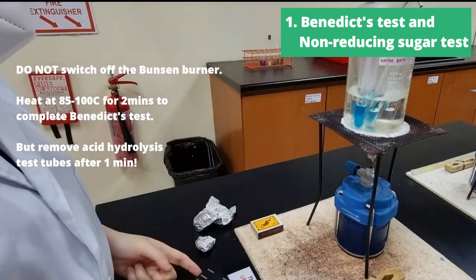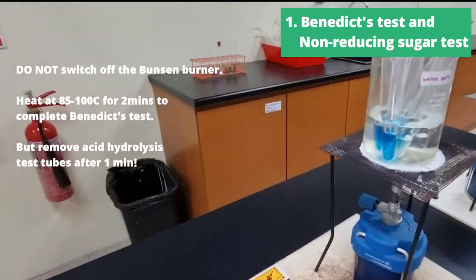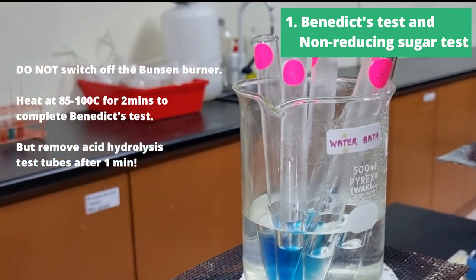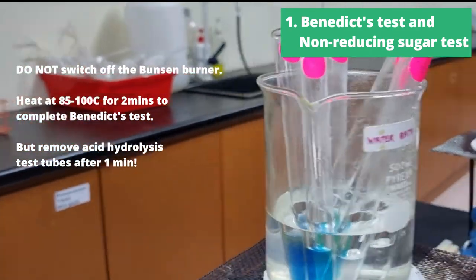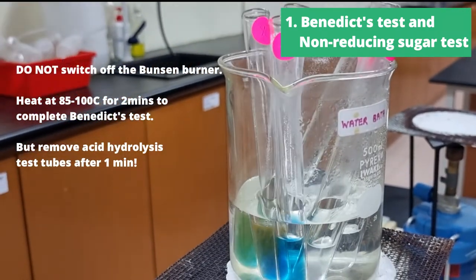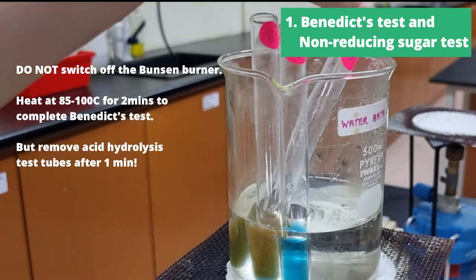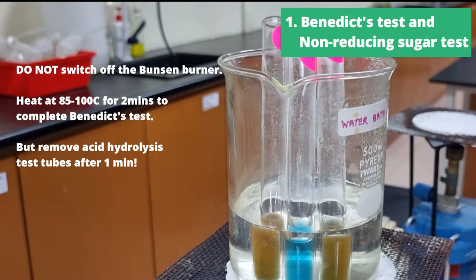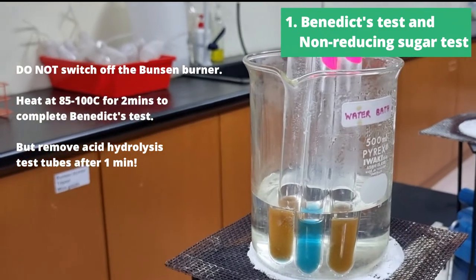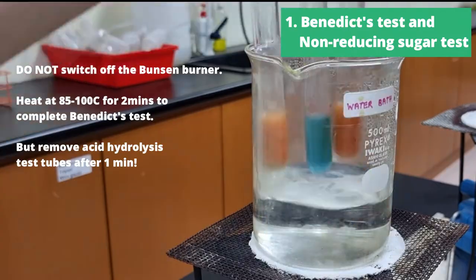Then we'll take all six test tubes and put them into the water bath at 85 to 100 degrees Celsius. For the acid hydrolysis test tubes, we're going to remove them after one minute, but for the Benedict's test tubes, we're going to leave them in for two minutes. Even before two minutes is up, we can see that X and Z are both changing color from blue to brick red precipitate, whereas Y is remaining as a blue solution.